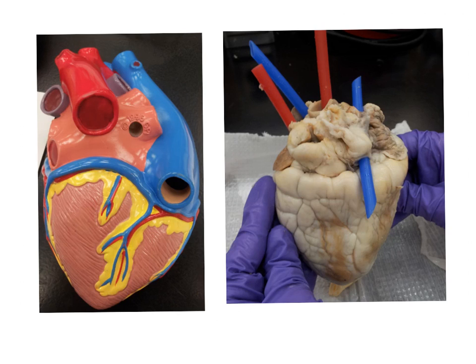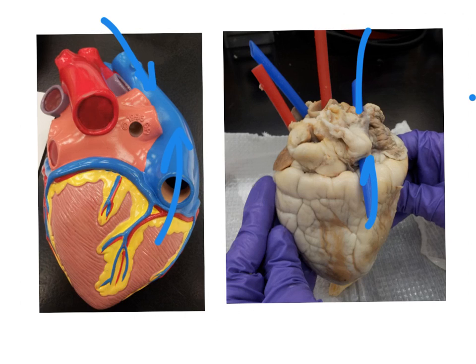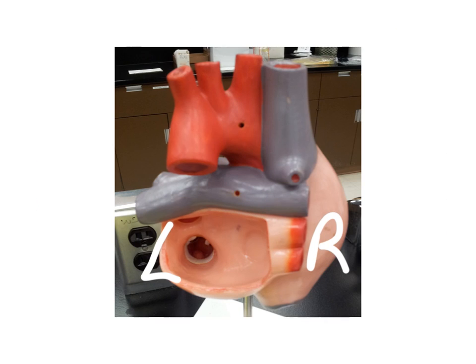Now looking at the dorsal view, we can clearly see the superior and inferior vena cava. There is the superior vena cava carrying deoxygenated blood, and there is the inferior vena cava. We can see the superior vena cava and inferior vena cava returning blood to the right atrium.